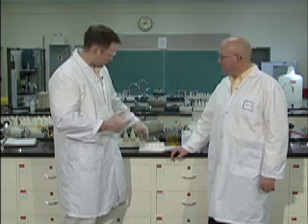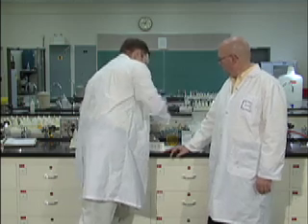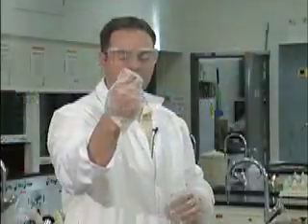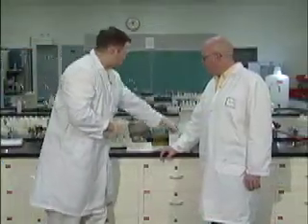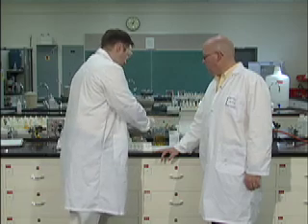So what you're going to do is take some of these tubes. Centrifuge tubes? Yeah. These ones are just 10 by 75 millimeter test tubes, just plain simple test tubes, nothing too fancy. And you're going to need about 6 of them for each unknown. So you're going to take 6 out of the box.